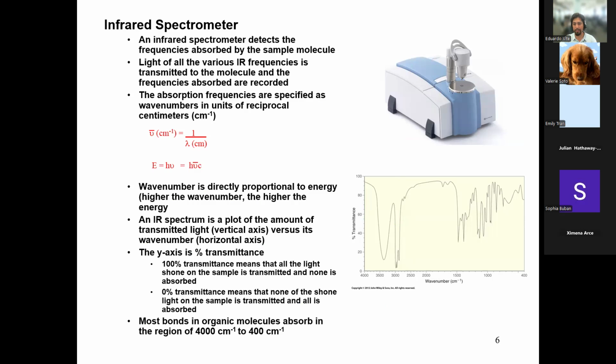So you're going to see that this peak is going to drop very close to zero if the bond has a high dipole change. And you have to be careful because this is where a lot of people get confused. Some people are saying, well, you told me polar bonds are strong bonds. Yeah, polar bonds in general tend to be strong bonds, but we're not measuring the strength of the polar bonds. Yes, we are. That is the x-axis. But we're also measuring the vibration of that polar bond. If a bond is polar, it should already be strong, right?